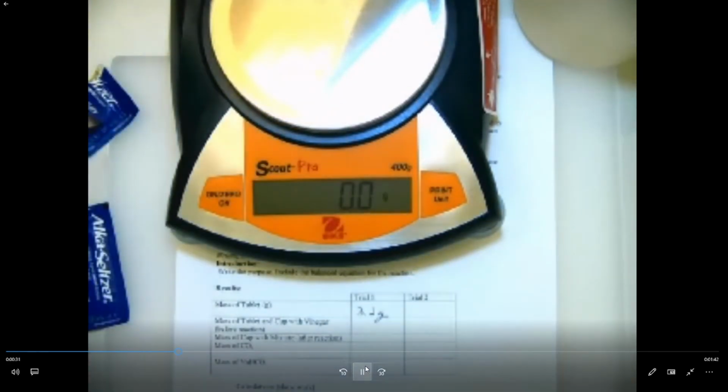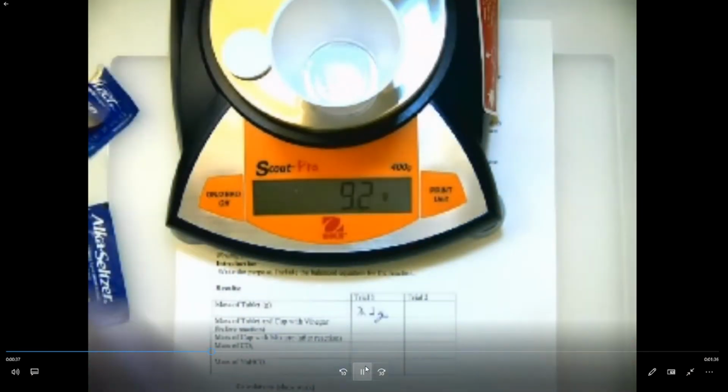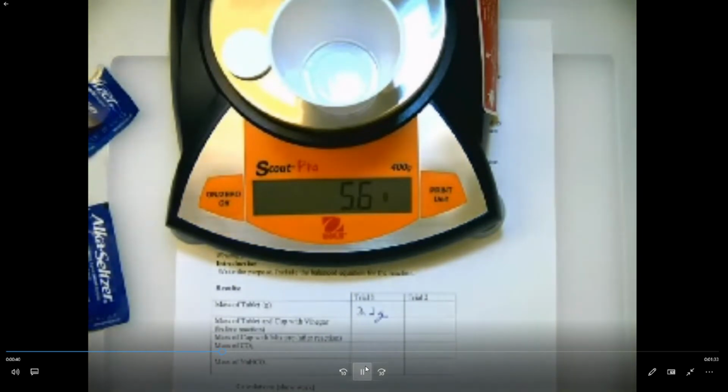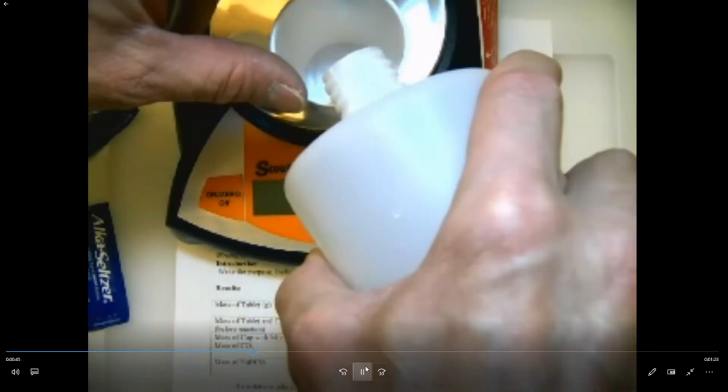By the way, I'm going to do something you should never do in lab. You should never pour a liquid over a balance. If you spill it, it goes into the balance, and then you bought yourself a broken balance. Not good.